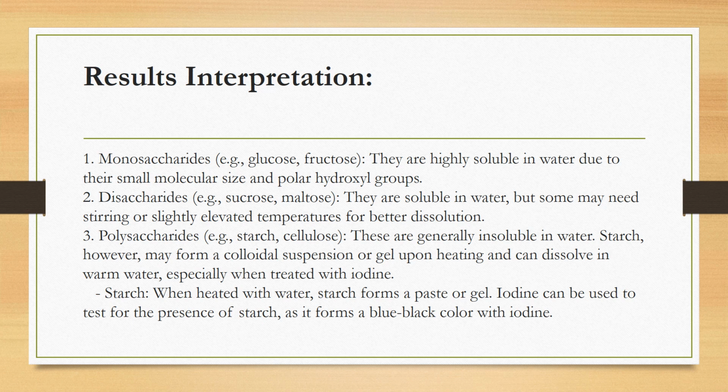So when testing starch, when heated with water, starch forms a paste or gel. Iodine can be used to test for the presence of starch, as it forms a blue-black color with iodine.